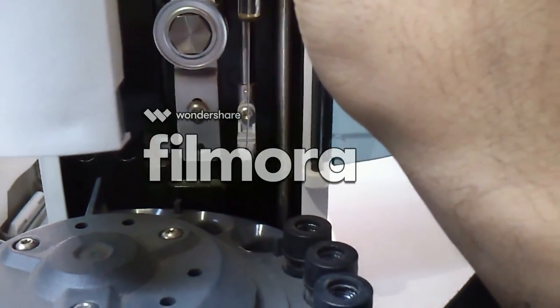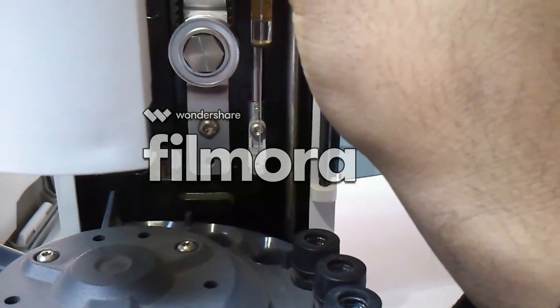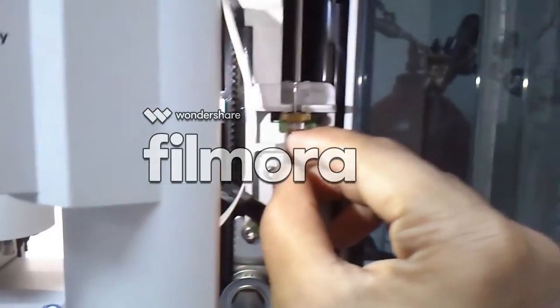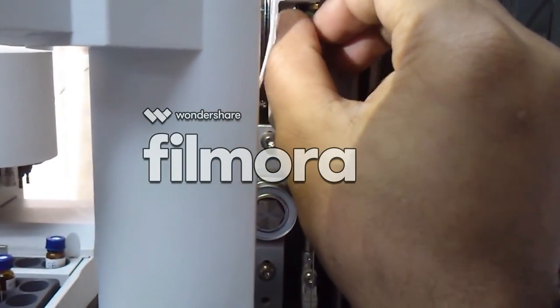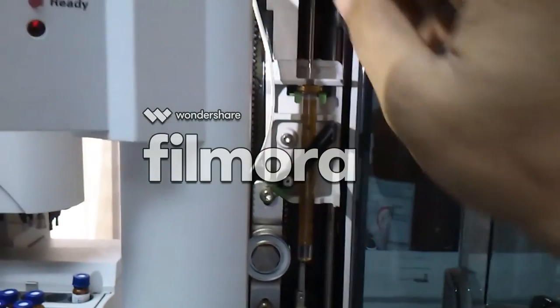Now place the syringe back to its location and tighten the screw. Also place the clip to hold the syringe.